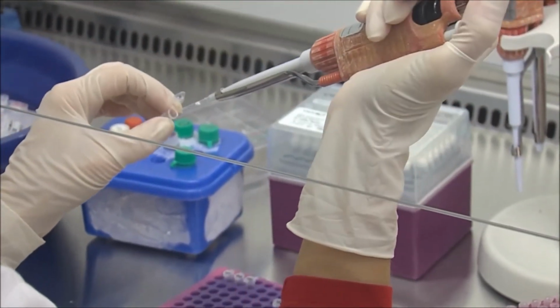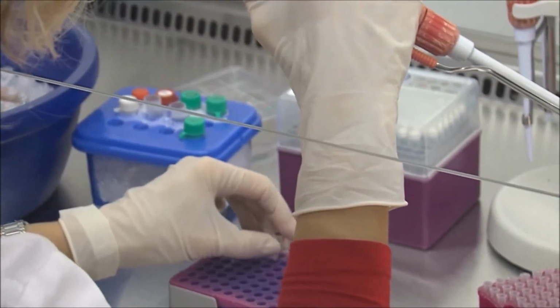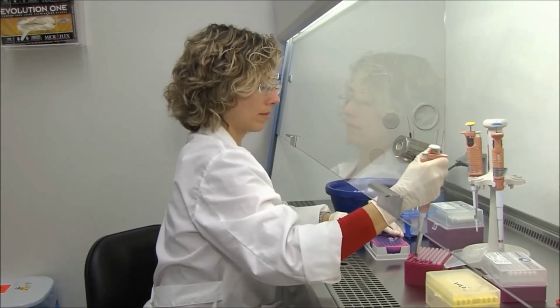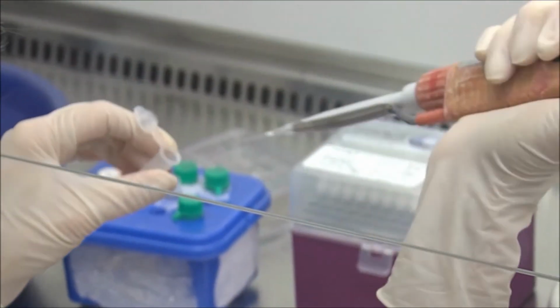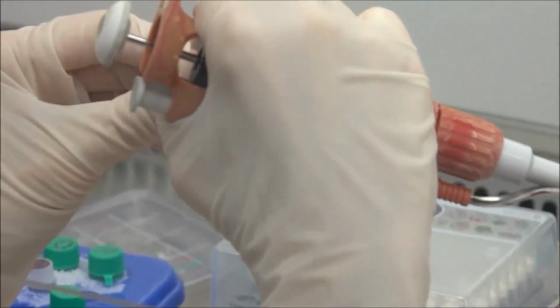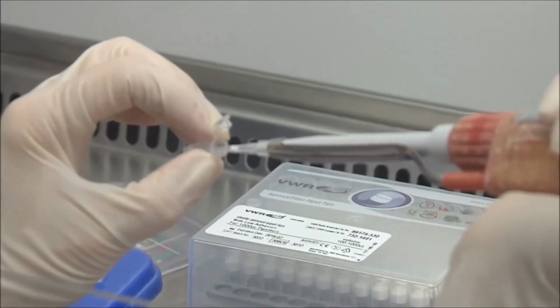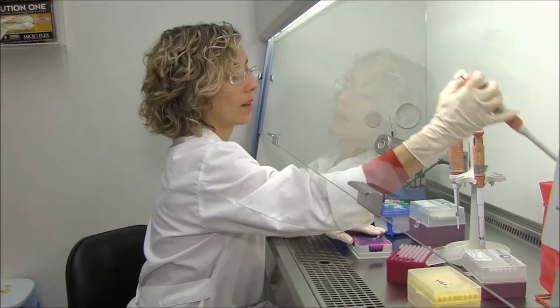Các bạn lưu ý là trong quá trình thao tác thì chúng ta vẫn phải giữ các mẫu cũng như các loại hóa chất ở trên đá bào để giữ lạnh. Tuy nhiên các bạn có thể mua những loại rack lạnh, nó thay thế cho đá bào và nó có thể giữ nhiệt độ của mẫu ở 4 độ C trong mấy tiếng đồng hồ, đủ cho các bạn thao tác. I'm going to add my positive control. And finally, I'm just gonna close the negative control tube.